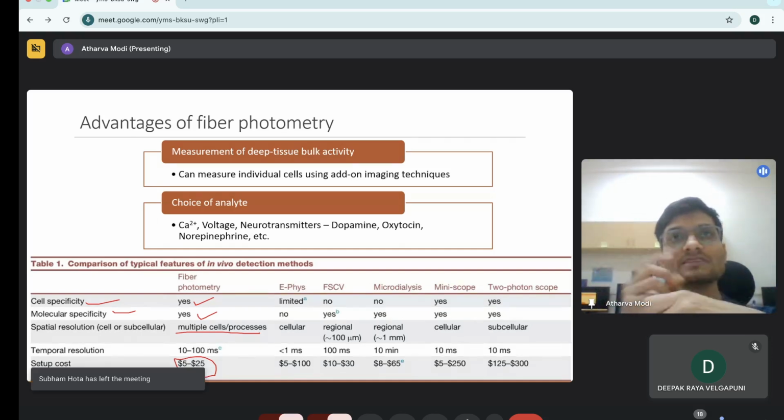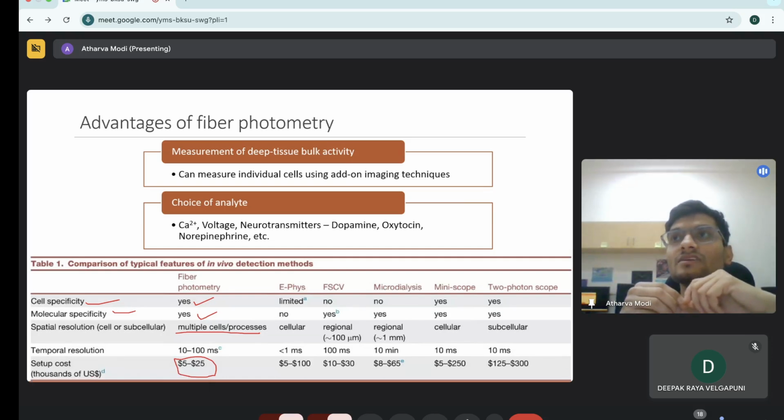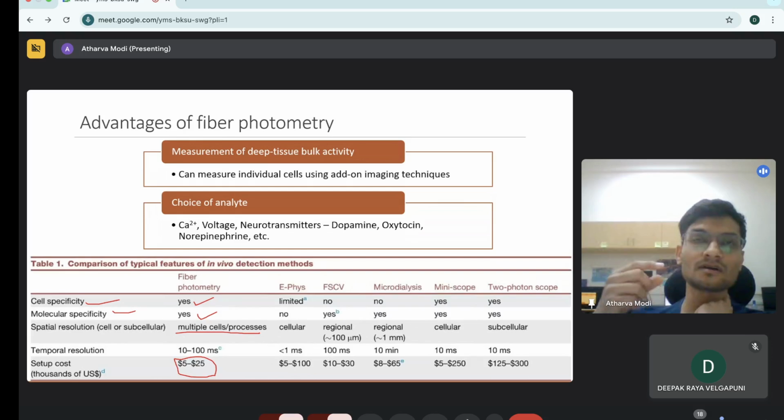Basically, it creates noise in the optical fiber that increases or decreases the measurement you have. So it's not a change in the sensor that is causing the increase. That's one answer to it.